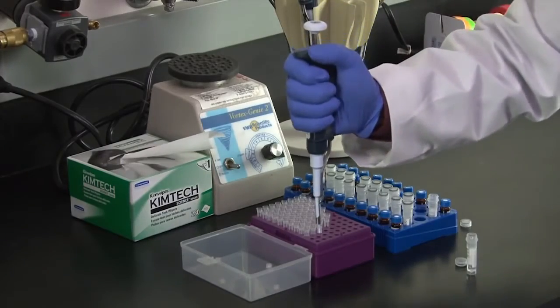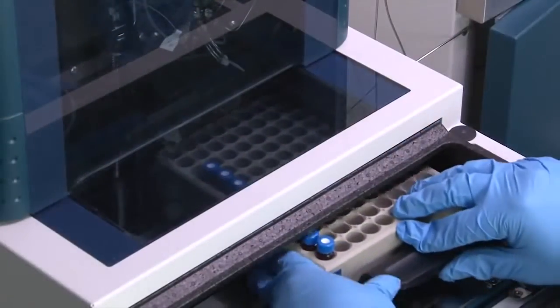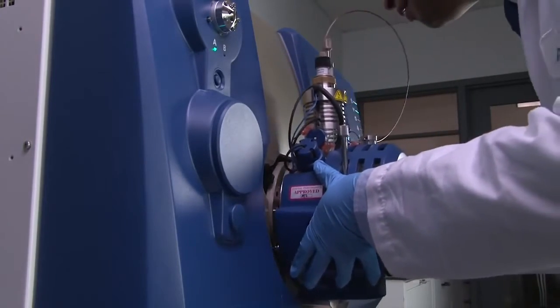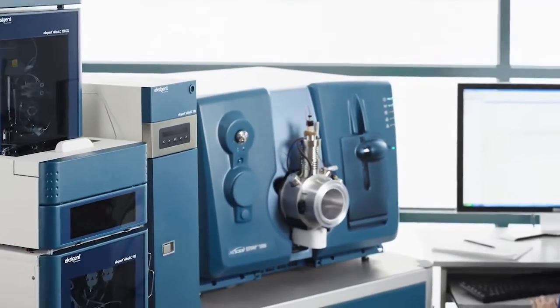Due to the complex nature of most samples, high-performance liquid chromatography, or HPLC, is usually coupled with mass spectrometry to provide physical separation of the components prior to entering the mass spec. Together they are abbreviated LC-MS.